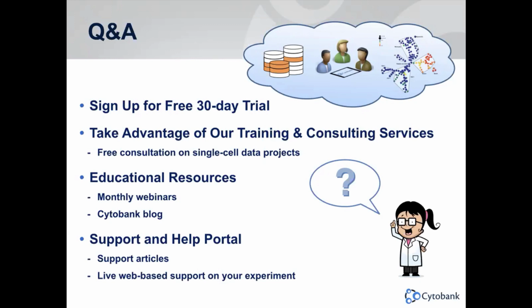We also sometimes find that the artifacts become more clear when you actually do algorithmic analysis. So if you have some batch effect, you will see, for example, that some of your samples tend to cluster into specific parts of the tree in your Citrus run. So that would clearly indicate that you have batch-to-batch variability.